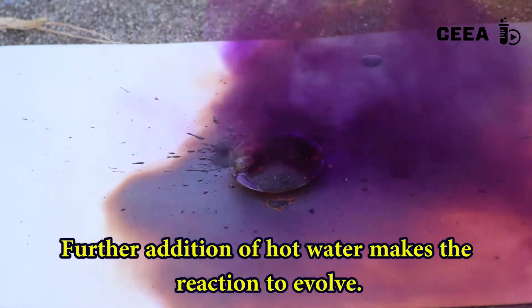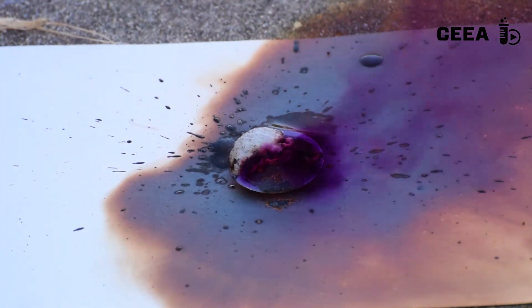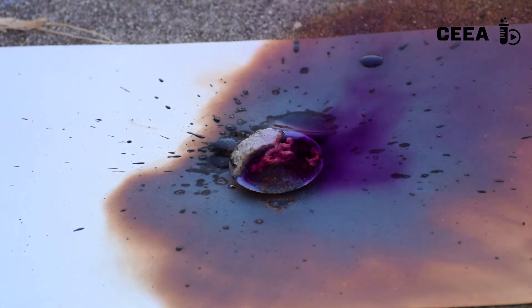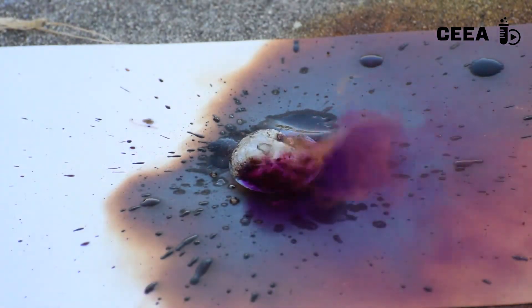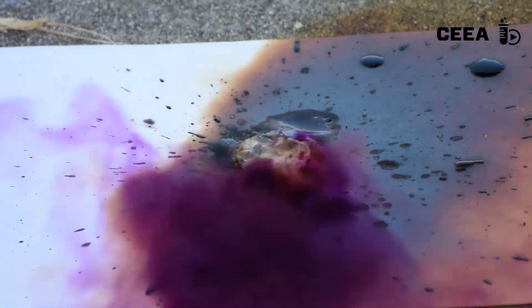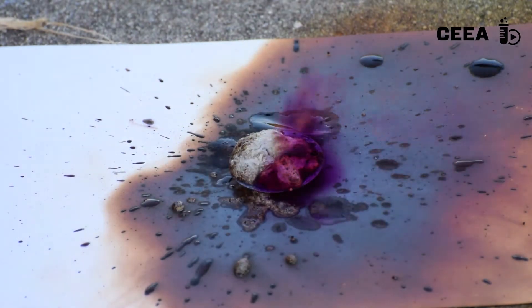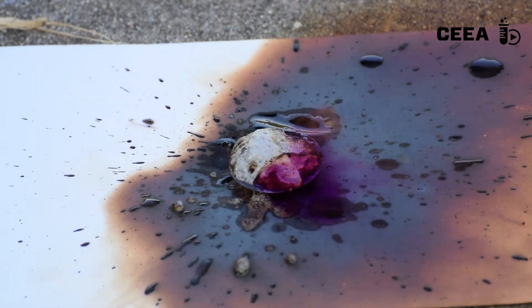Notice the abundant violet cloud formed by the sublimation of the iodine. Continuing the addition of hot water, we make the reaction further evolve. As a safety measure, we do the reaction either outside or in a ventilated hood.